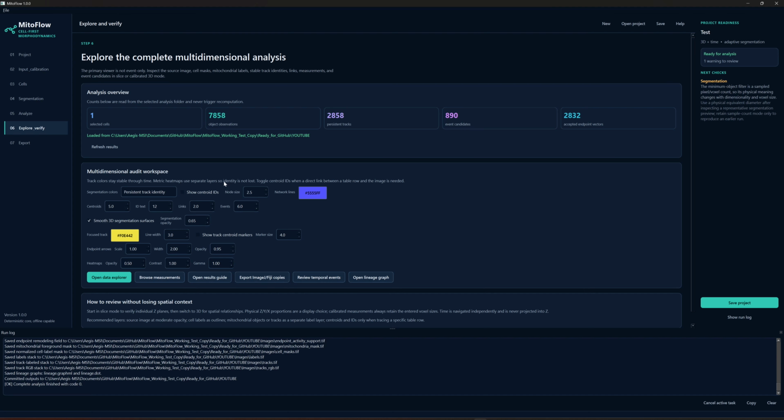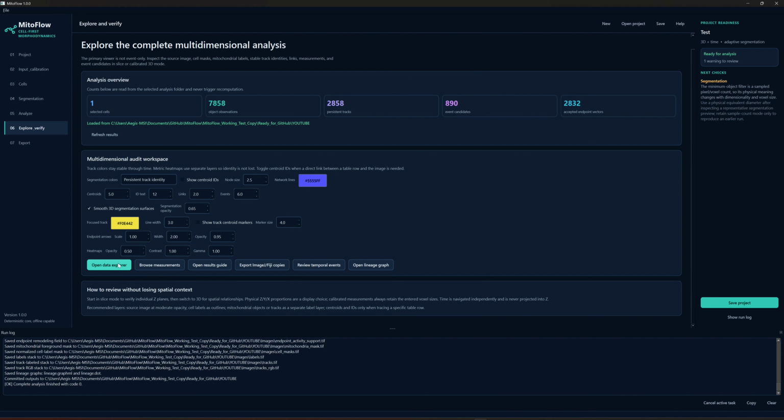And the result can still look perfectly fine at a quick glance, but between consecutive frames, the program builds candidate parent-child pairs from voxel overlaps and calibrated distances. Each pair receives a cost that combines overlap through an intersection over union term. And in fact, I'm not going to go over the detail of the math here, but the documentation will provide more on that. But the analysis is done.